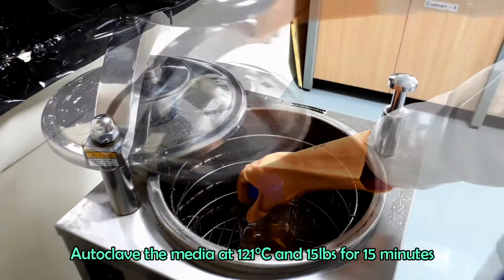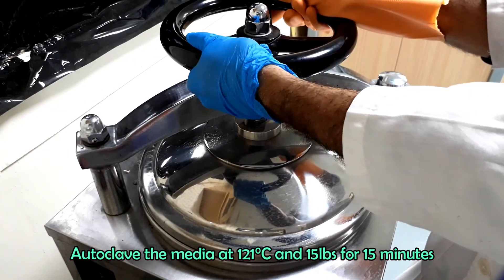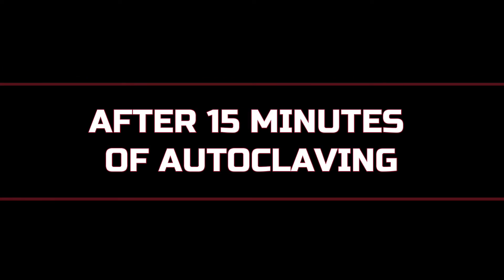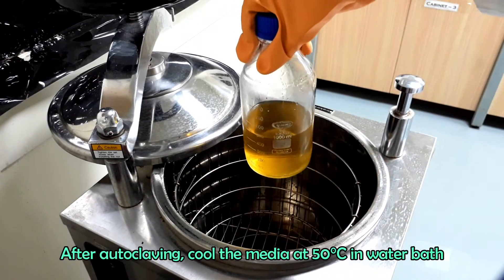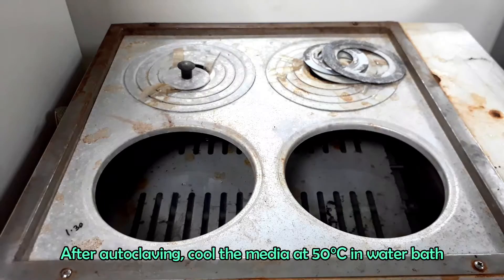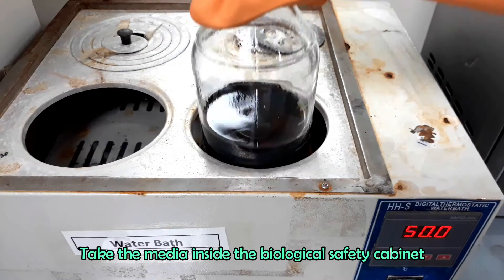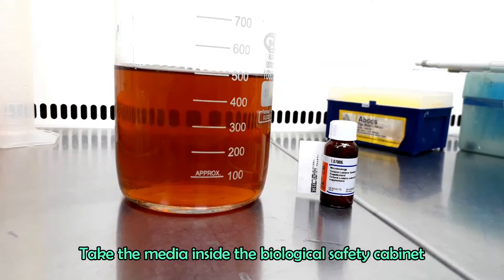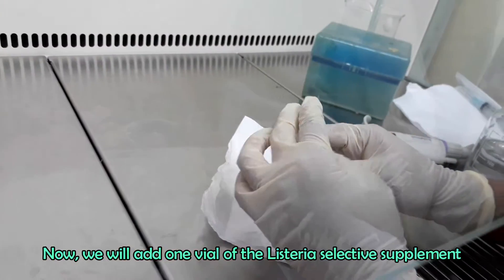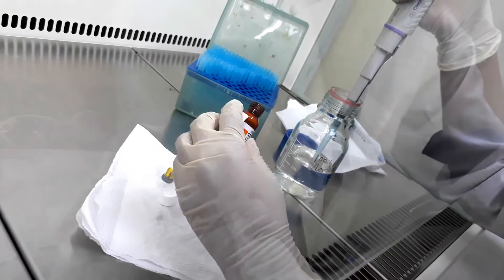Autoclave the media at 121 degrees Celsius and 15 pounds pressure for 15 minutes. After autoclaving, cool the media at 50 degrees Celsius using a water bath. Take the media inside the biological safety cabinet. Add one vial of Listeria Selective Supplement as done previously for Oxford Agar.